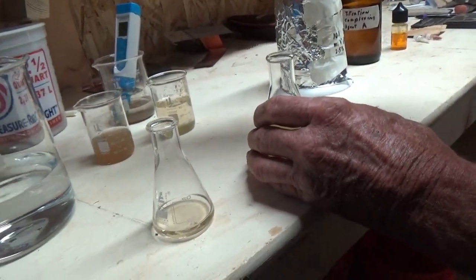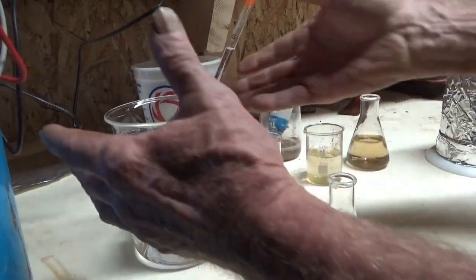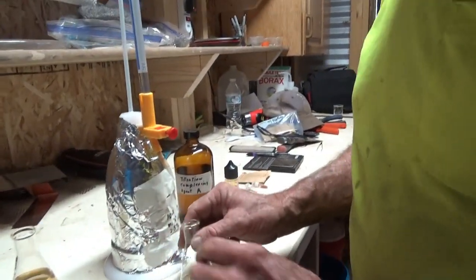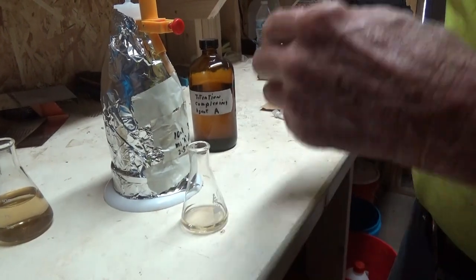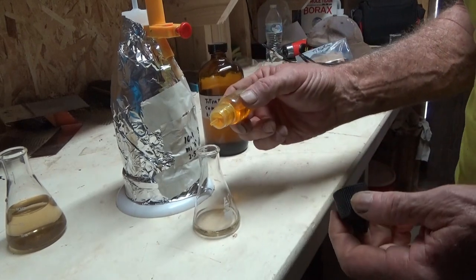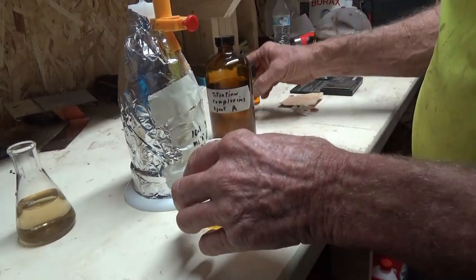Now, this is pure water and it does two things. Number one, it helps clean it between tests. Number two, it provides someplace I can put the burette where it won't fall over and get broken. So now we have our sample. That sample is just the pure EcoGoldX. Should be about a 1% solution, which means it should take about 2 cc's to titrate it. First, you add the indicator, so it's 2 to 4 drops here.